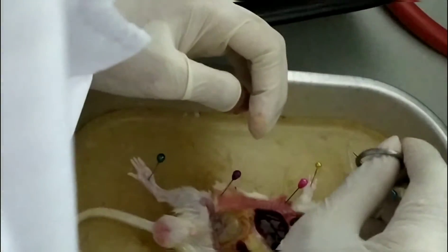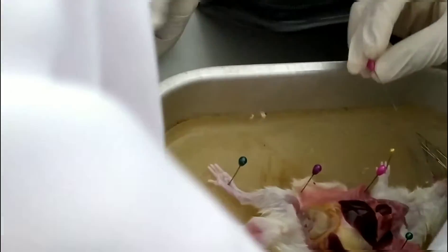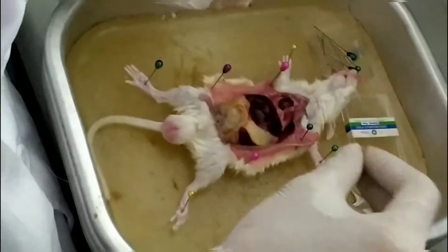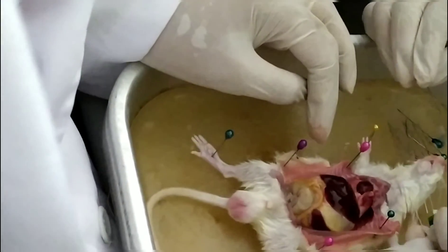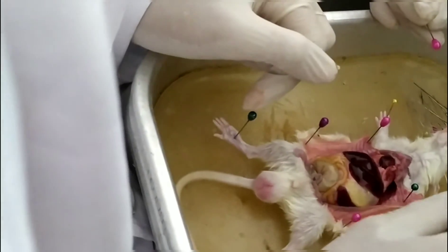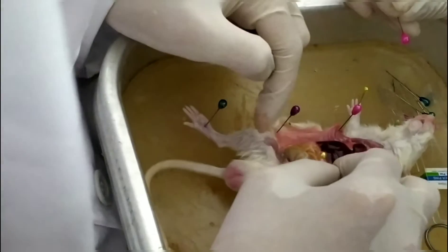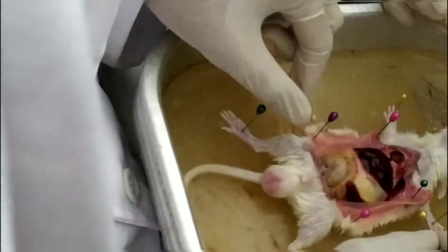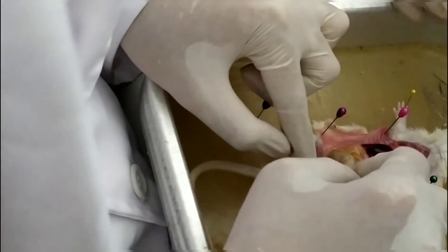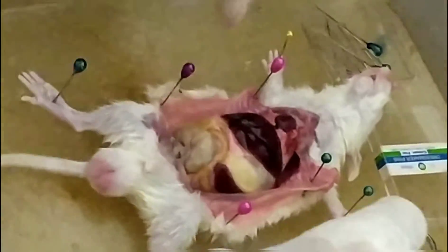Let me explain the organs. That is the lungs, the heart, and also the lungs on the other side. Going down, that is the liver, and that is the stomach. That's the small intestine and this is the large intestine. Those are the organs inside.